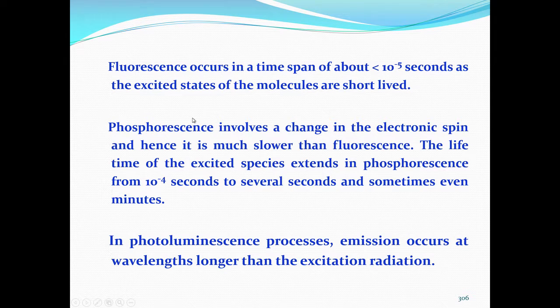Now, fluorescence occurs in a time span of about 10⁻⁵ seconds, as the excited molecules are short lived. In general, absorption takes place in about 10⁻¹⁵ seconds. Compared to that, fluorescence is quite a slow process, and phosphorescence takes much more time.